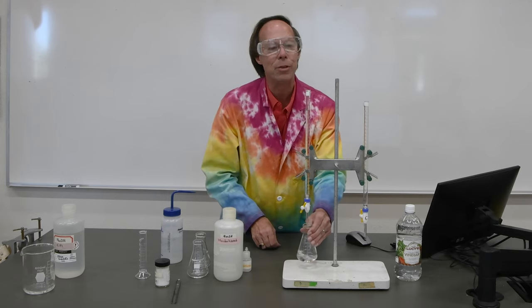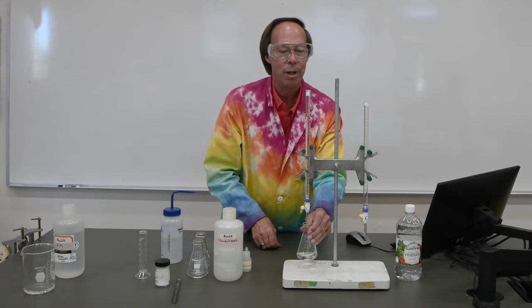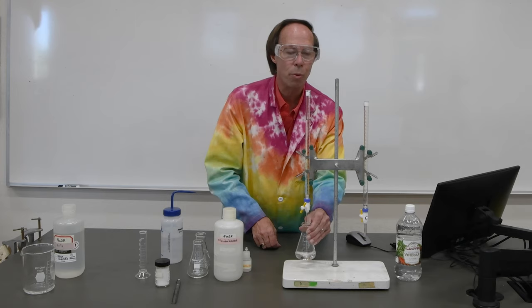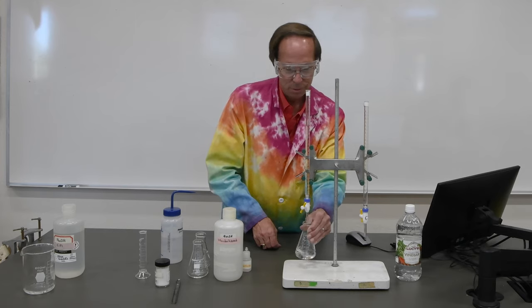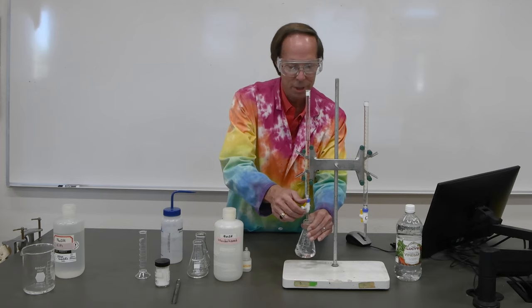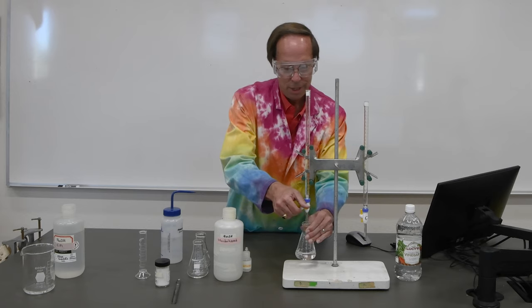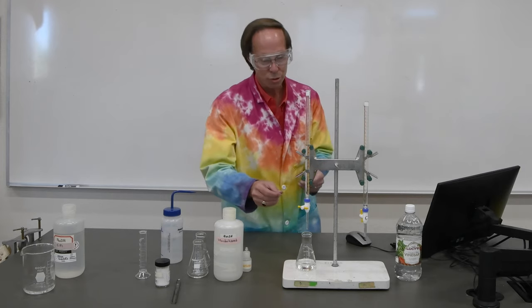I'm not using a magnet this time to mix it, so we'll just keep swirling it around. There's 2, 3 milliliters. 4, 5, 6, 7, 8, 9. We're getting closer now. There's 10, 11. I actually started seeing little bits of pink appearing, which tells us that it's beginning to get close.